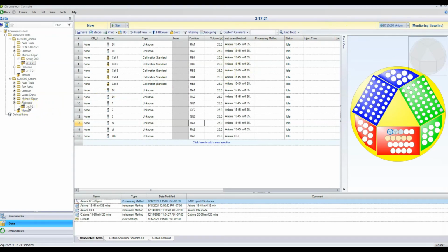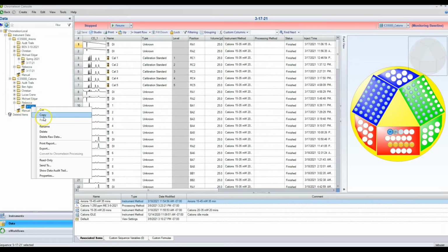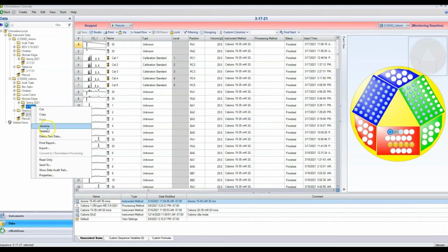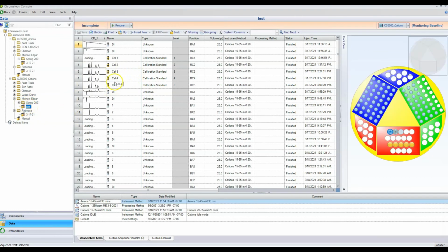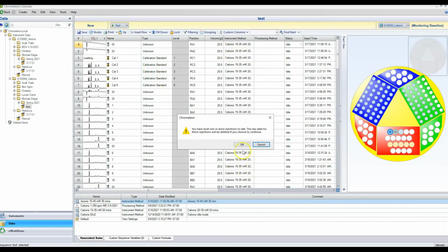So an easy way to do that, let's do the same thing that we did for our cation. I'm going to copy Rebecca's and paste it into my own file. Now if I want to rename it, I can just call this test, because this is basically a test. I still have to go through the same process, right? So pay attention. Just changing this to idle, fill it down, and then save. So I'm deleting all the data.